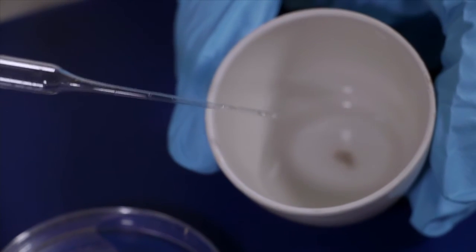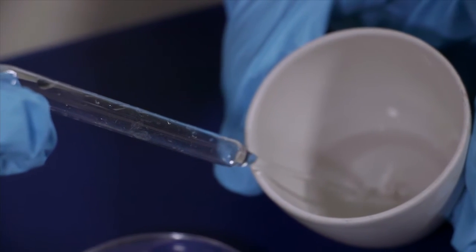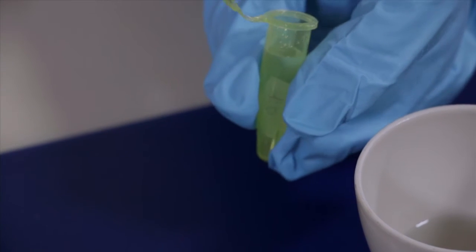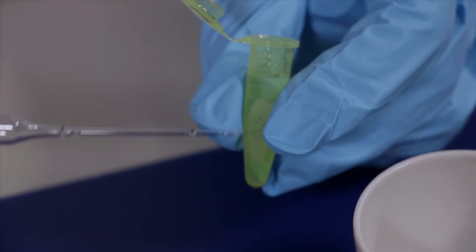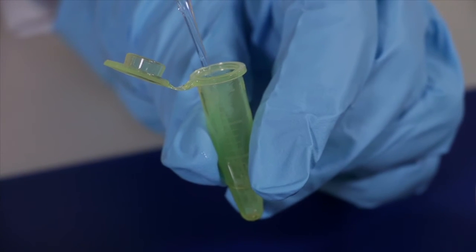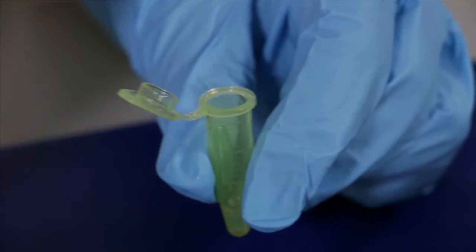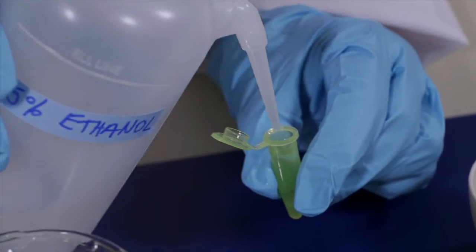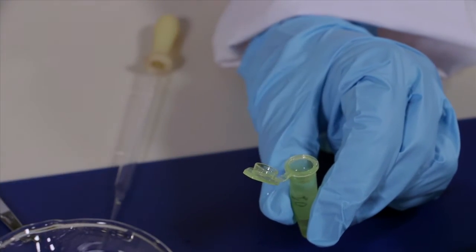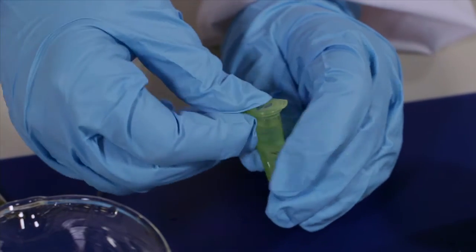After the spicules are cleaned, we are going to pipette them to an Eppendorf to store them. We are going to wait again for a few minutes for them to accumulate on the bottom of the Eppendorf. Now I'm going to take most of this water out and store the spicules in ethanol. Be sure that you label your Eppendorf and match this number with the sample number in your spreadsheet on your computer.